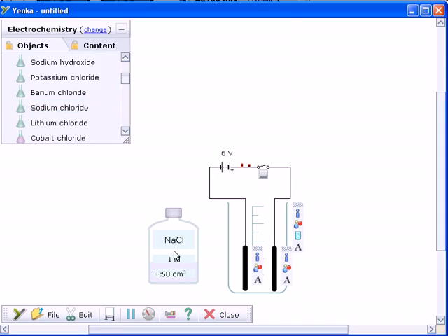For each electrolyte you can set the concentration and volume precisely by clicking on the label and typing a new value.